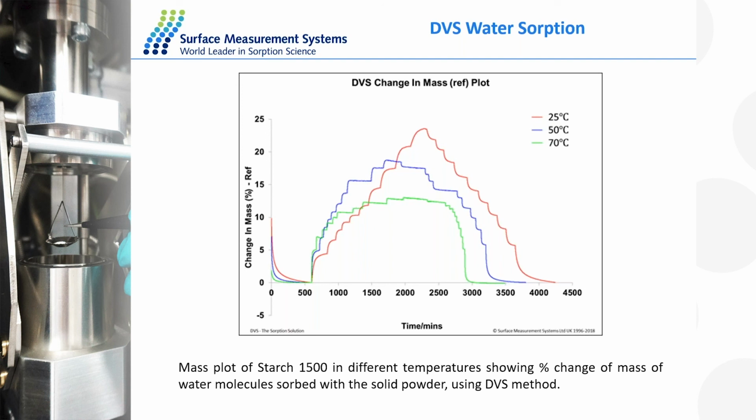affected. So to begin with, you see an increase, and then at each particular step, especially if you go to 70 degrees, this effect is more observable. You see a dip in the generation, and at the same time you see a dip in the mass uptake as well.